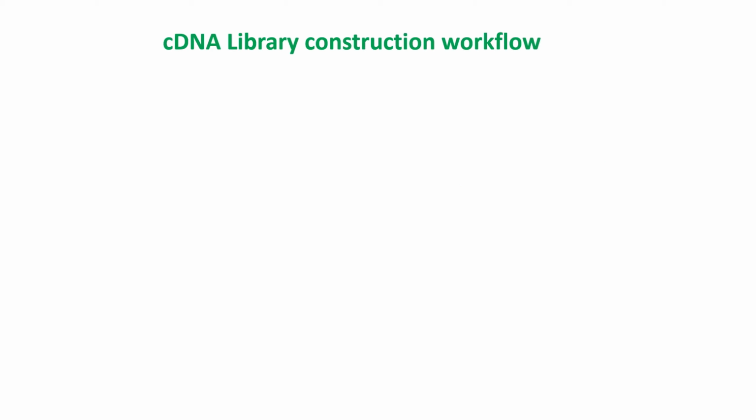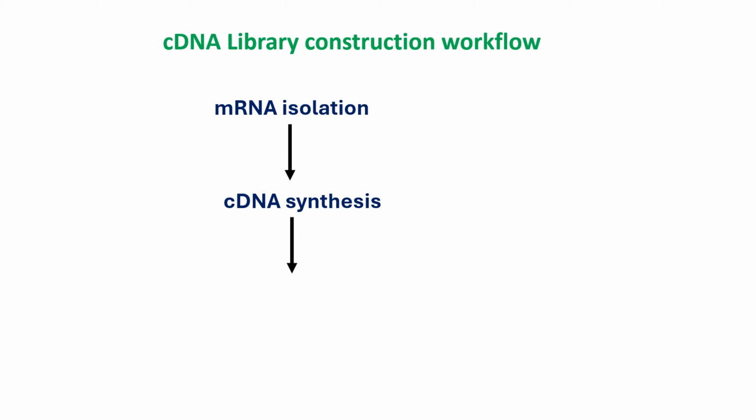Now, let's talk about the workflow of cDNA library construction. I would like to take you through the workflow before delving deep into the detail of each of the various steps. So the first step involves mRNA isolation from the cell or the tissue of interest, and this is followed by synthesis of cDNA using the mRNA as a template, and then moving on to perform cloning.